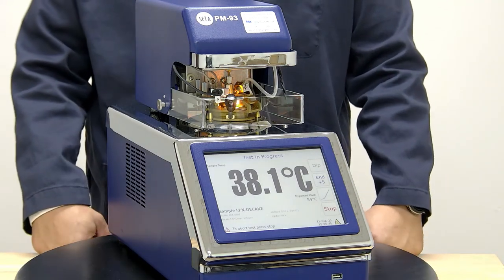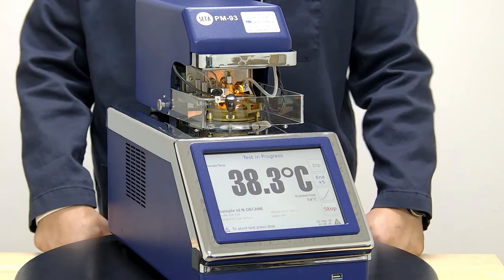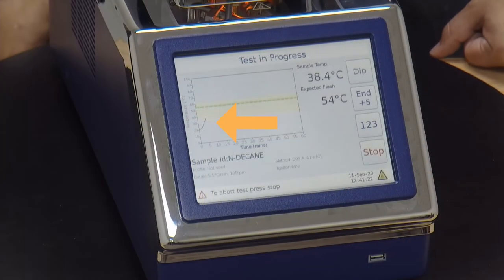So you can easily see the sample temperature from across the room. We have a graph being populated as the sample temperature increases and time goes along. It'll be graphed here on your right, my left.